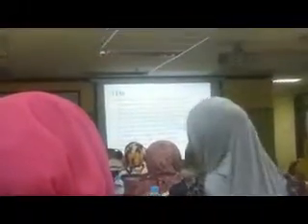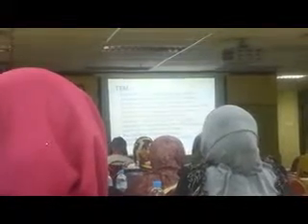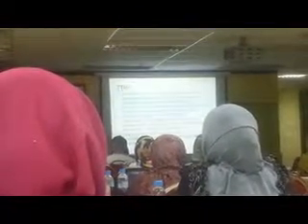So TEM, I just want to tell two things about TEM also. The difference between SEM and TEM is that SEM scans the surface spot by spot. That's why it's called a scanning electron microscope. In TEM, the electrons go through the sample and give, in one click, like a photo. Right? You just click once, then you get the entire image in one go. But SEM is a reconstruction of the information you got spot by spot, in the form of a two-dimensional image. It is a computer-generated image in SEM. But in TEM, it's a real image that is actually coming. You can put a photographic plate and get it.